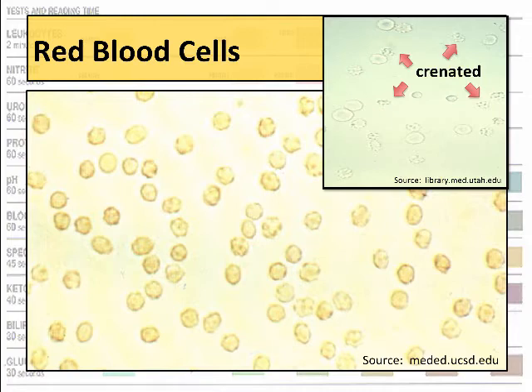One of the things that you can tie to the presence of red blood cells in the urine is potentially kidney damage. You shouldn't really have much in the urine. As I said, 1 to 2 is normal, but that's it. If you have any sort of kidney damage and the kidney is allowing the red blood cells to get into the urine, that is something significant. This is obviously quite a bit of red blood cells here, something to report.